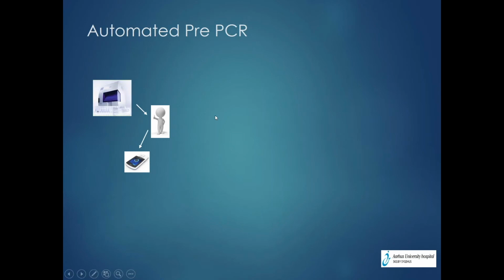When automating the pre-PCR, we still need the technician in there, because due to the way our sample comes into the lab, we still do the DNA purification on an EC1. We could do it on another station that would track it in another way, but we get the sample and need to, at the final point, decide what to do.